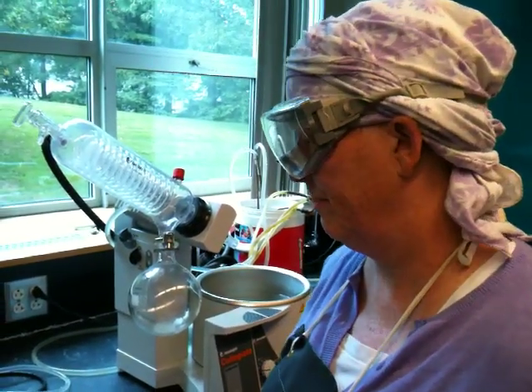Hi class, I am going to do a demonstration of how to do a rotavap on our equipment at Braymar College.